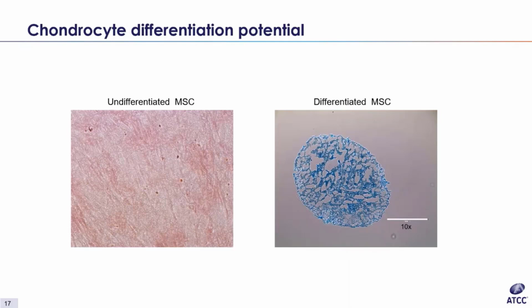Here, iPSC-derived MSCs were differentiated to chondrocytes in 3D culture using chondrocyte differentiation tool, which is ATCC part number PCS-500-051. For 21 days, we did that. The cells were fixed, sectioned, and stained with Alcian blue stain, which dyes cartilage. I used the control from the previous slide for comparison so you can see the profound blue stain indicating the cartilage in the extracellular matrix.